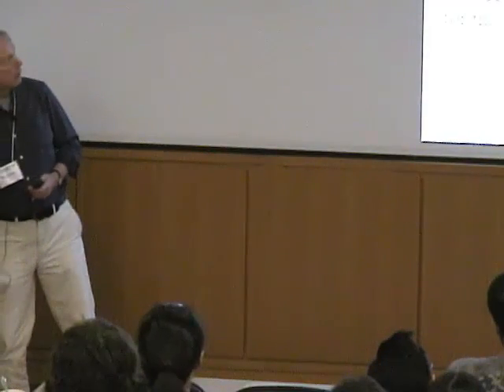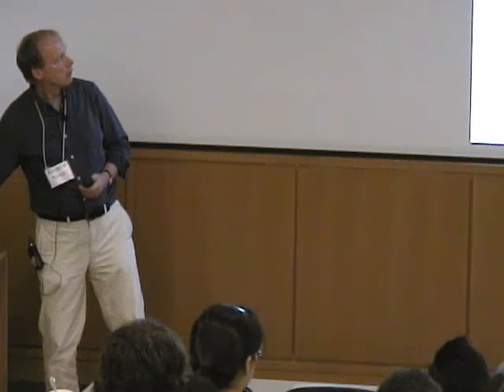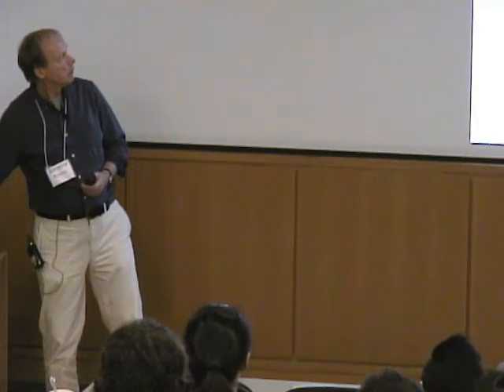And in doing that, we do that numerically, right? There are numerical methods which will allow you to determine this matrix U, right? Maybe I should go back to that. But don't you need at least a rough idea of the molecular orientation of the crystal within the spectrometer? Yes. Let me just see if I can find that here.